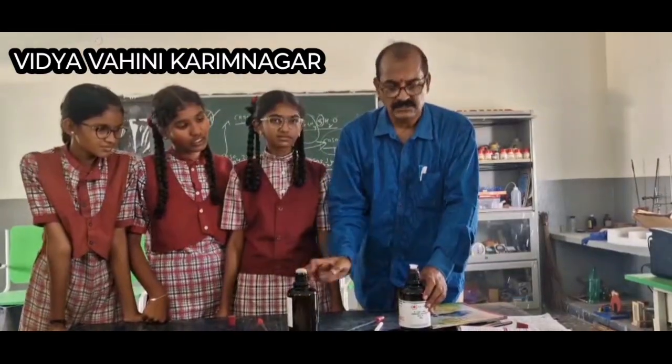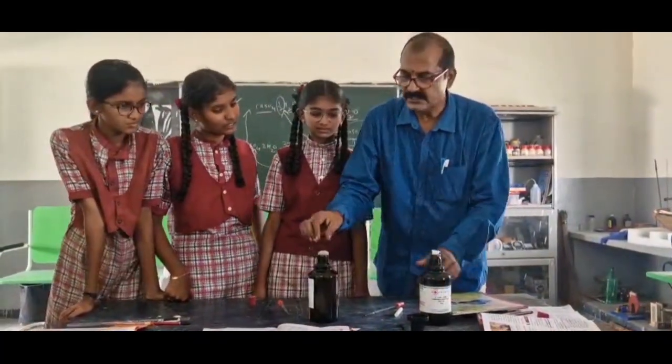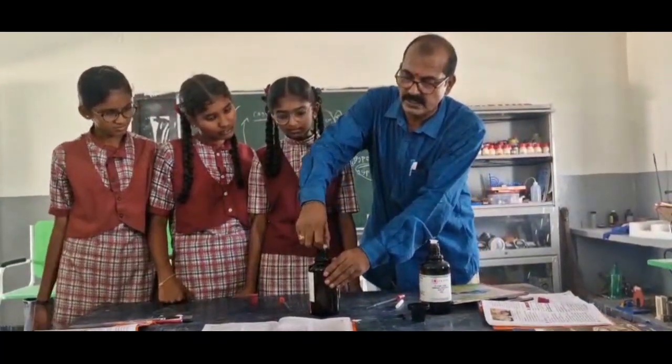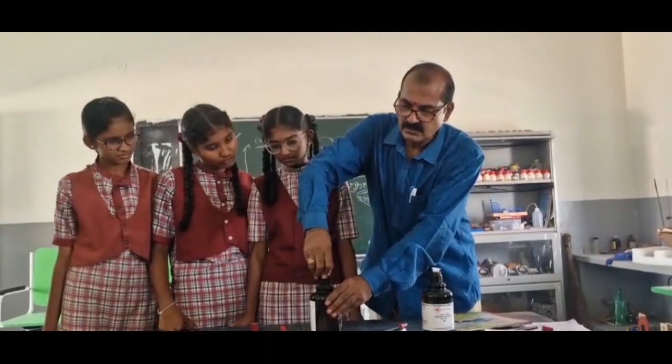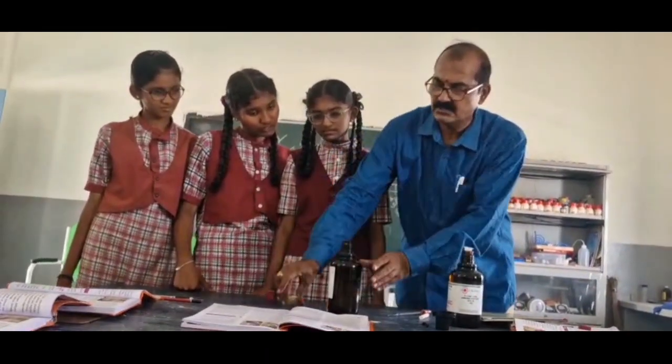Hydrochloric acid. This one is the ammonia solution. Both are solutions, no? Just I am keeping it near these two bottles. What will happen? See, here also a chemical reaction is going on. So here also we are observing.